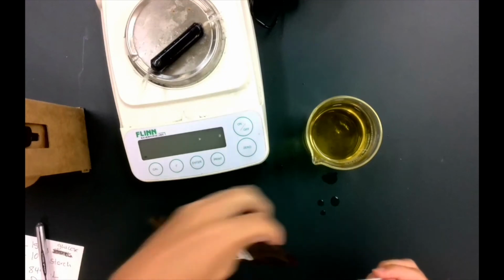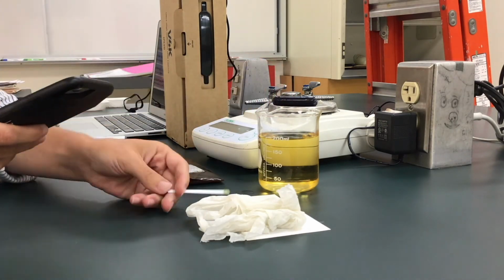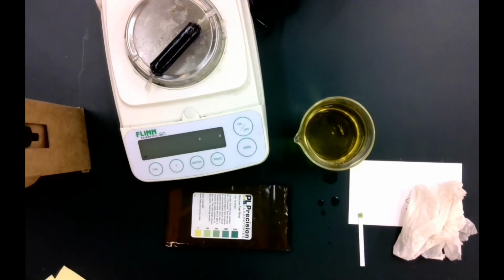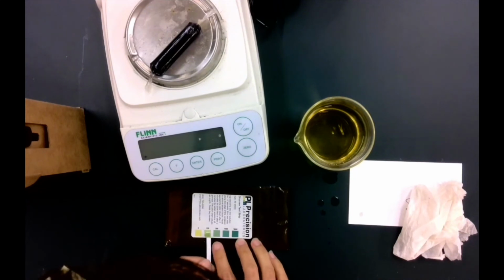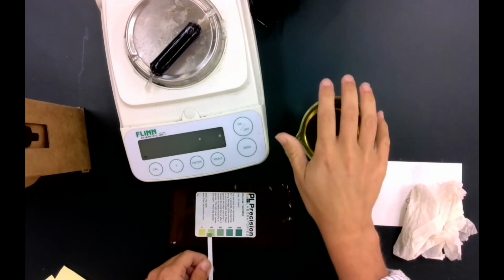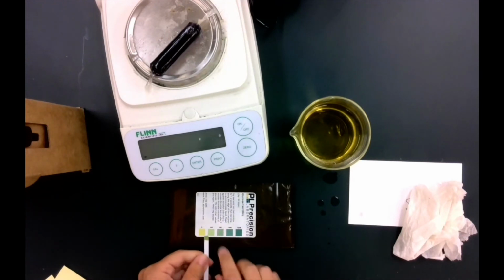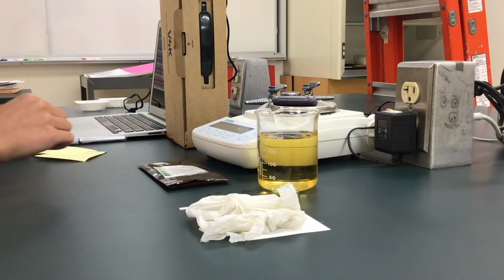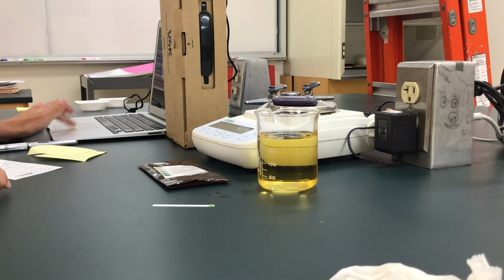So I'm once again going to take my test strips, and we're going to do the same thing that we did last time. Okay, let's take a reading on our glucose test strip. This looks to be around 100, I think 300 is a little dark. So outside of our bag, in our flask and in our beaker that we put absolutely no glucose in, we are finding evidence of glucose. It's right around 100, maybe 200 milligrams per deciliter. So I'm going to write that down so that we are able to record what's happening. And that's it.